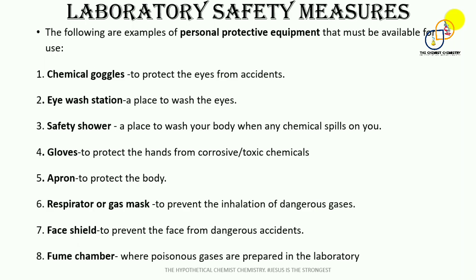Now we have safety personal protective equipment, and this must be available for use in the laboratory for your safety. The first one is the chemical goggle to protect the eye from accident. The second is the eye wash station, a place to wash your eyes in case a chemical splashes in your face.